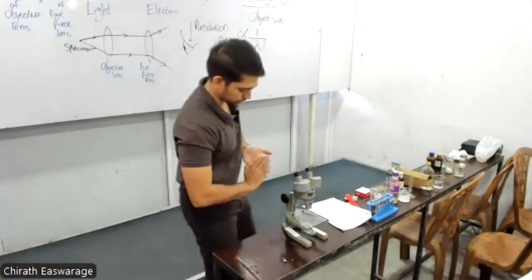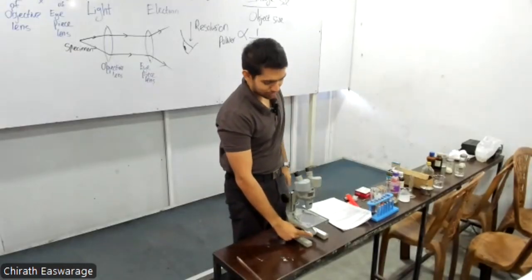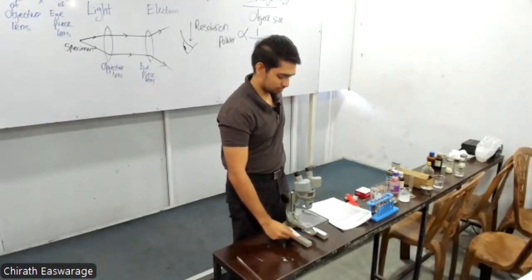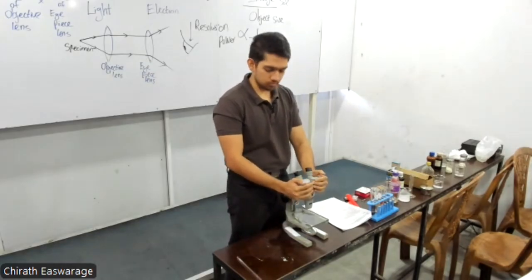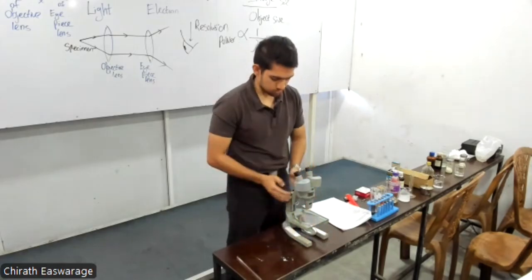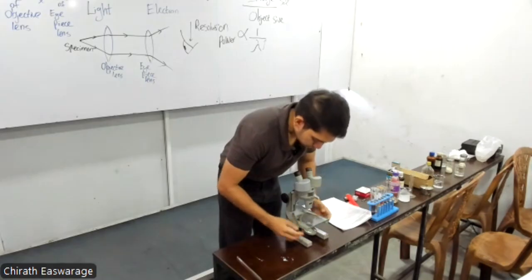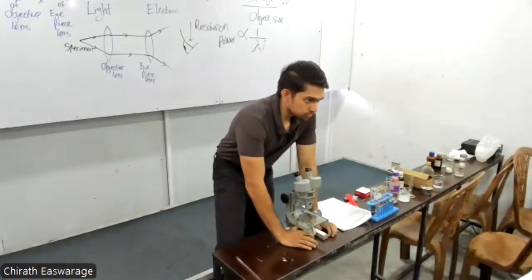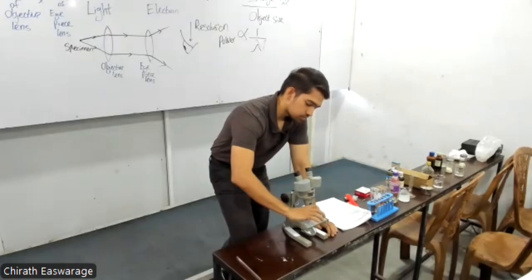Why do I need adequate illumination in this case? Because what is the light source? It's a concave mirror, right? The mirror. Then the basic parts. What are the two parts you know now? This is the base, this is the arm, right? Then this is the light source, the mirror, the source of illumination.